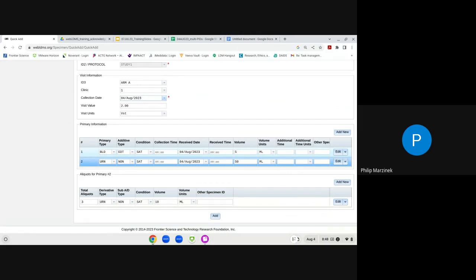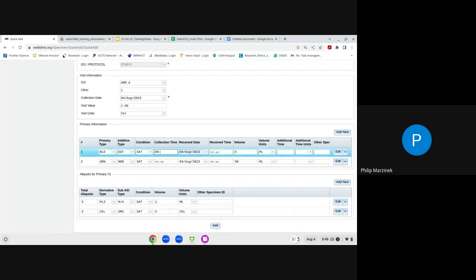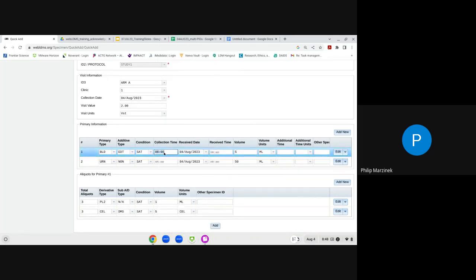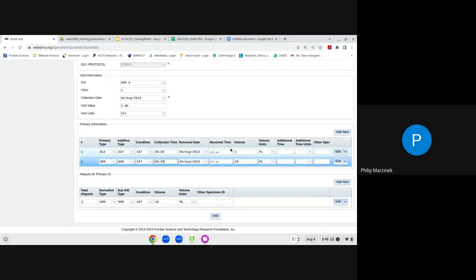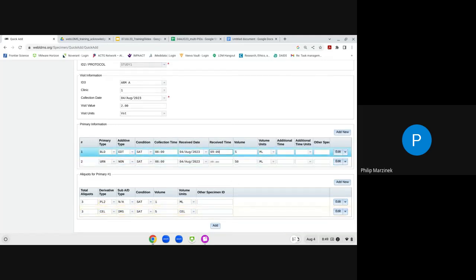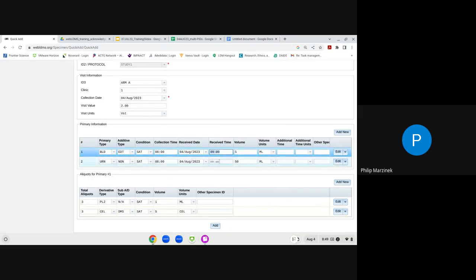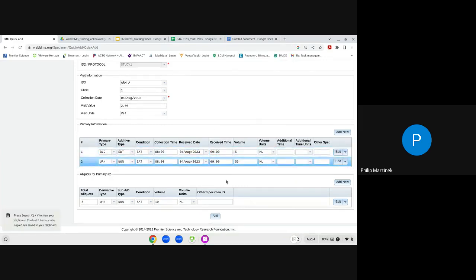For the collection time and receive time, if both occurred at the same time you can use Ctrl+C and Ctrl+V to copy and paste, saving data entry time.